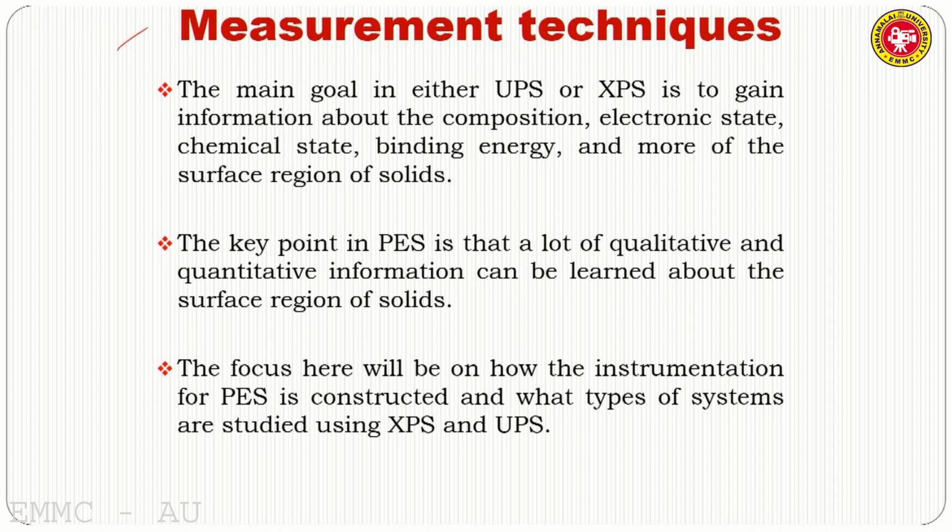Next, measurement technique. How do you measure PES? The main goal in either UPS or XPS is to give information about the composition, electronic state, chemical state, binding energy, and more of the surface region of solids. The key point in PES is that a lot of qualitative and quantitative information can be learned about the surface region of solids. The focus here will be on how the instrumentation for PES is constructed and what types of systems are studied using XPS and UPS.